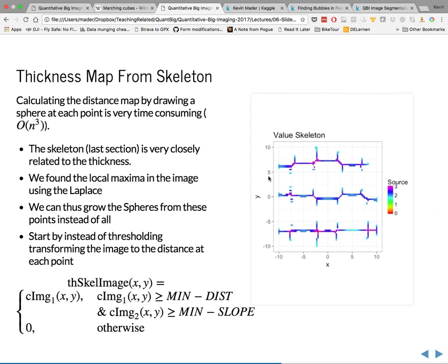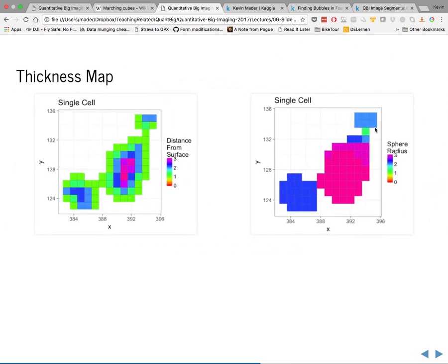For this cell, this single point is potentially important if it's exchanging genetic material or splitting or doing something like that. But for a large object, a single point would potentially not be very relevant, because there wouldn't be much flow; that single point doesn't go anywhere. It's just a single point. It's probably noise or air or something like that. And so it requires some understanding of what you're actually looking at to decide which things you include in your thickness map and which ones you don't.